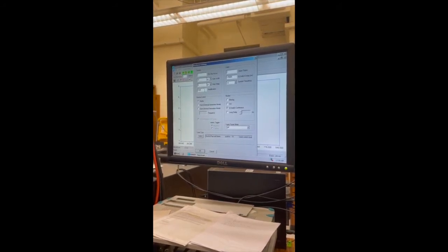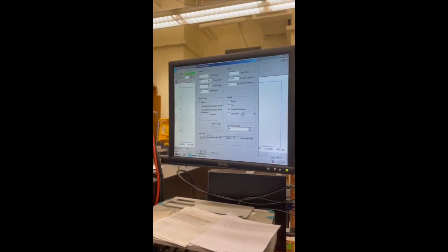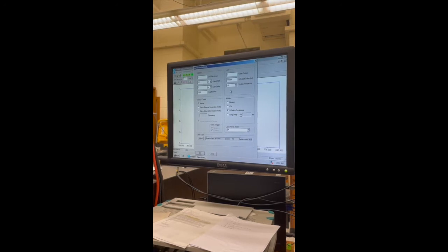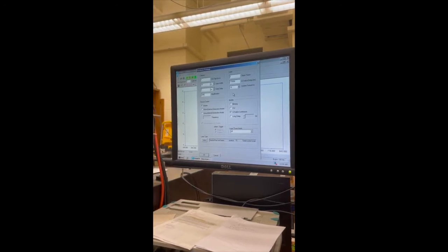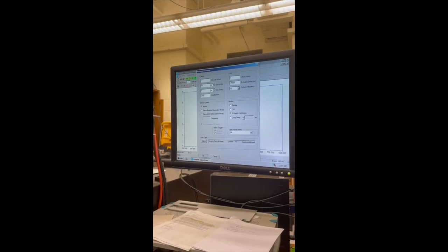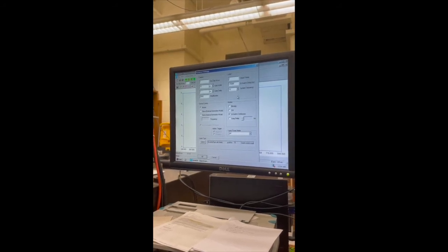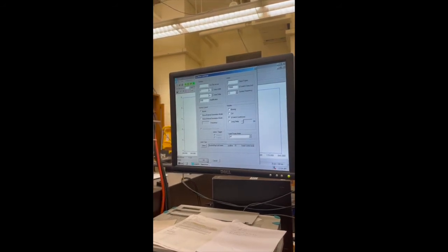For the steel, the amplification is set to 2000. We're not really sure what the units of that are, so always just make sure you look and see what somebody had written down to use the right values. The Q switch delay and system frequency are set for our laser, so you don't ever want to touch those. Okay, how does that look? Looks all correct up here, Dr. Rehse. Okay, perfect. Let's go ahead and say OK to confirm that.